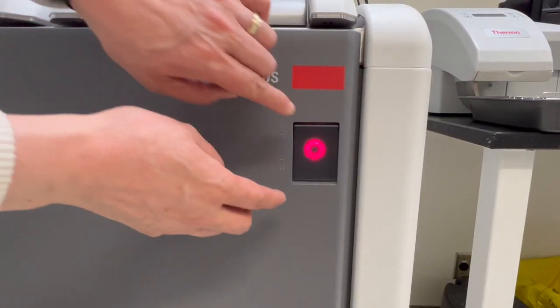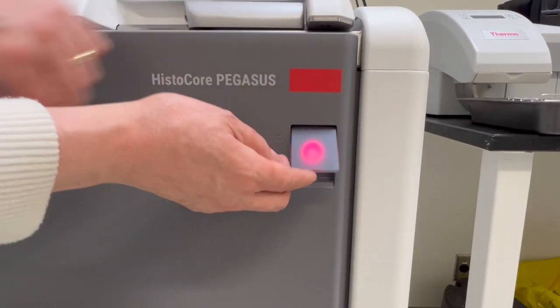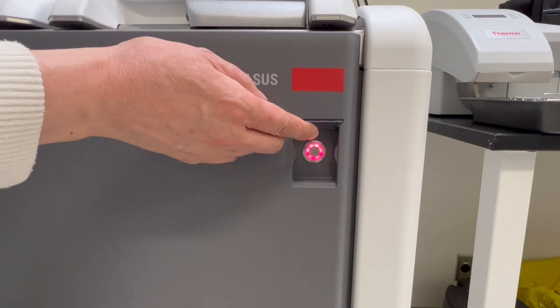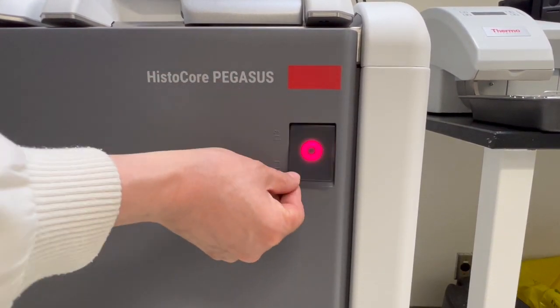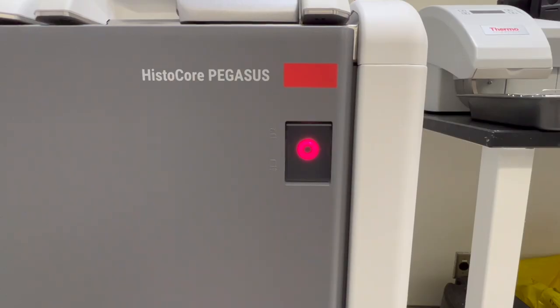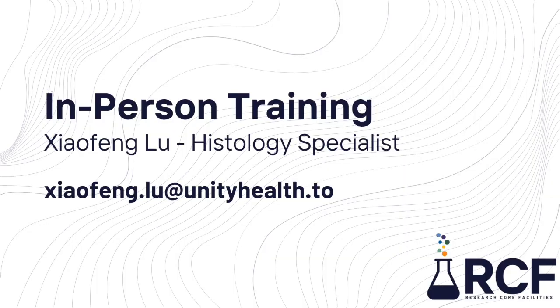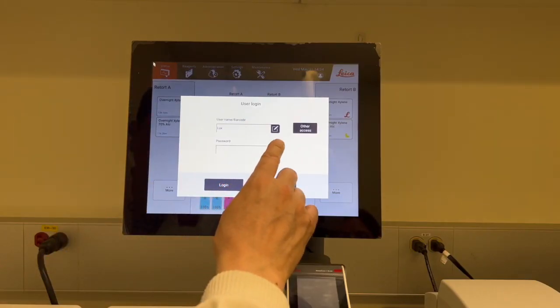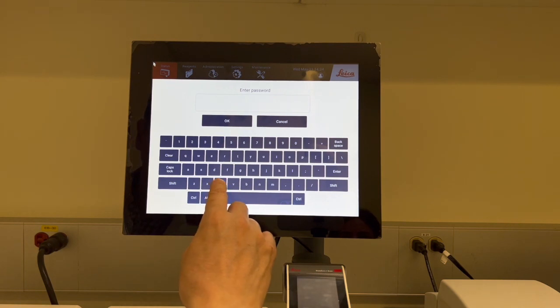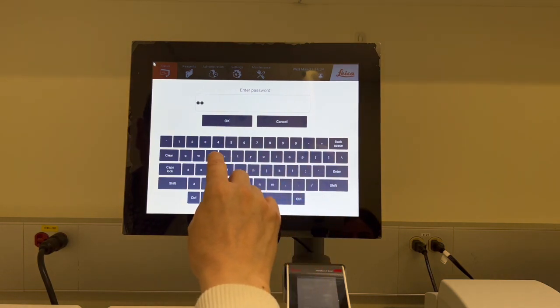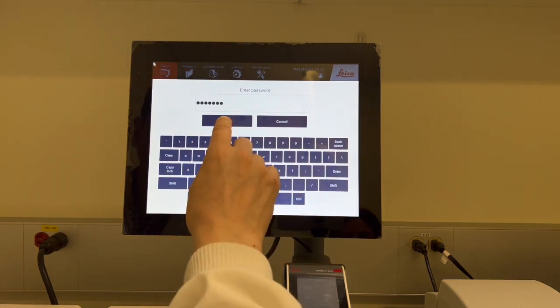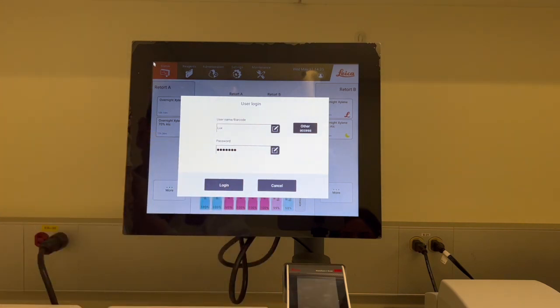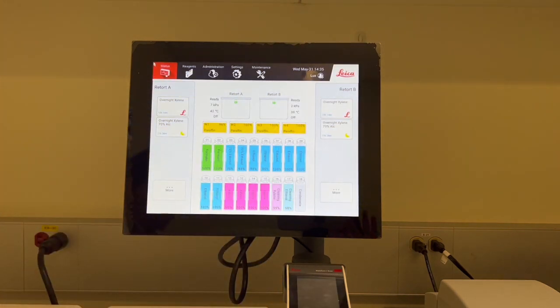This is the main power switch. Under normal conditions, please keep the instrument on at all times. If there is an emergency, you can press the main power switch to shut it down immediately. After watching this video, please contact your histology specialist to get in-person training. Once you have completed the training, you will have your own account with a username and password. Here is where you will enter your username and password, then tap Login. The status screen will be displayed.